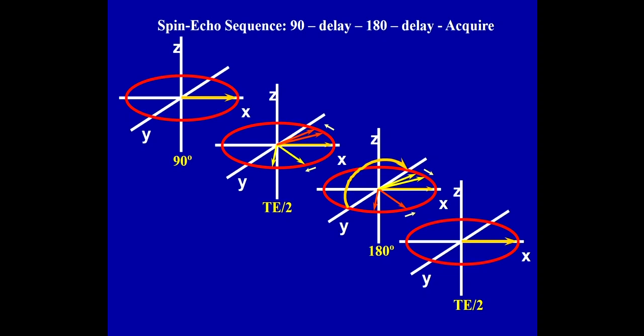So here is something called the spin echo sequence. I'll show you a movie of this in a moment. We start with Z magnetization, tip it into the XY plane. So this is just a pulse acquire start to it. And we don't open the receiver, but we wait a bit, something called an echo time. We're waiting for half of TE, half of the echo time.